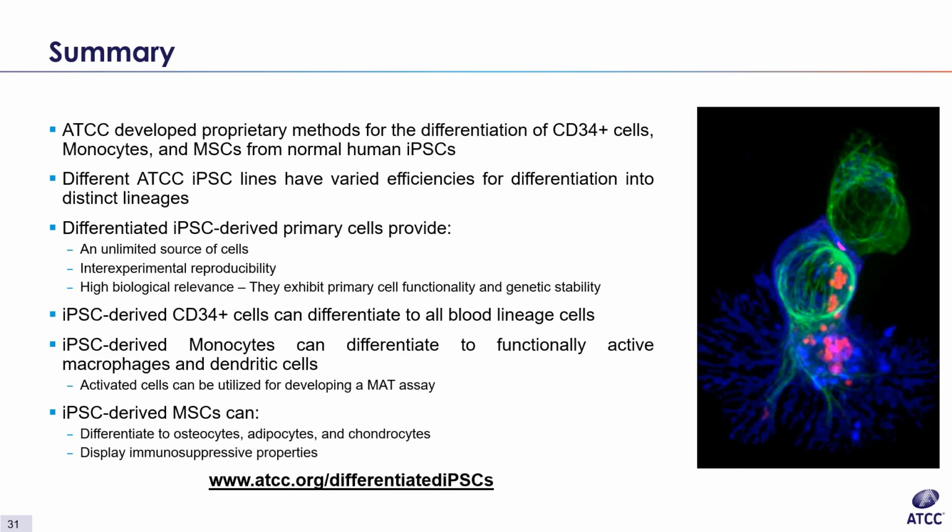Another thing is that these cells could be used for studying COVID-19 or SARS-CoV-2 infection. Earlier, I showed the mesenchymal stem cell immunosuppressive capacity. So they could be used to study mechanisms for immunosuppression, maybe to evaluate the anti-inflammatory response to viral infection and the cytokine storm.